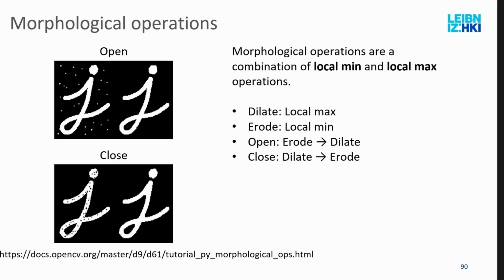It's not perfect, as you can see. You see it even here, that this corner is not as before. So they are a bit disruptive, these morphological operations, and you should use them carefully where it's applicable.